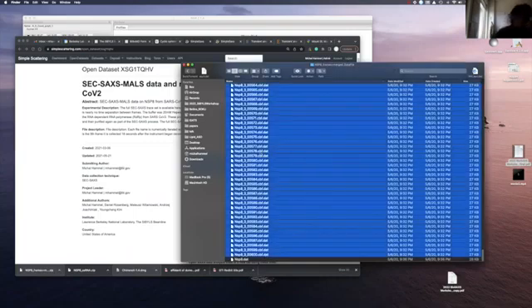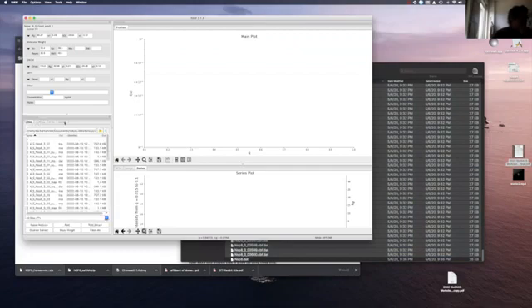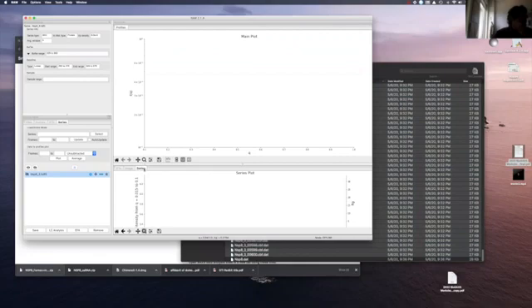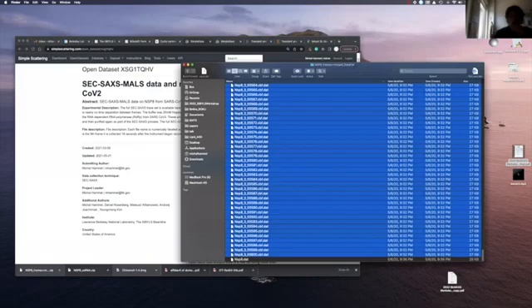Those are the single frames for our elution. Every frame is a 2-second exposure across your elution. And so let's just start RAW. If you start RAW, you can click here on the series, and that's right here too. I'm going to start RAW from scratch, so we're going to close it. There we go. So we can start RAW.